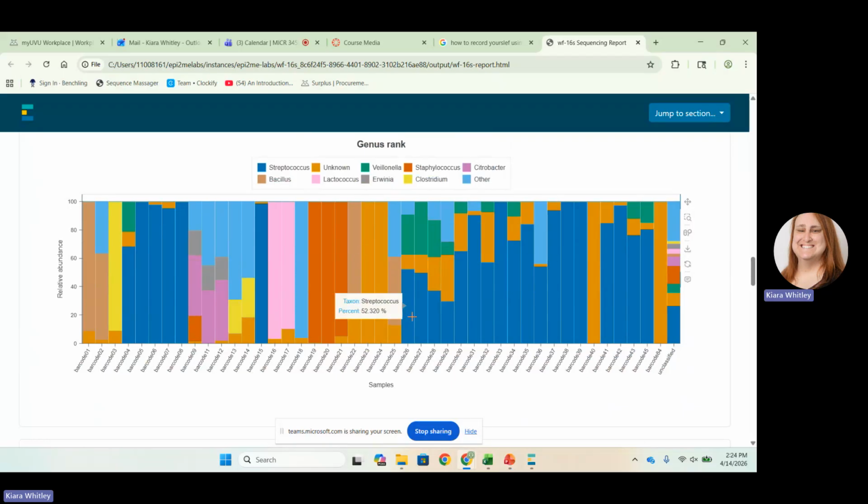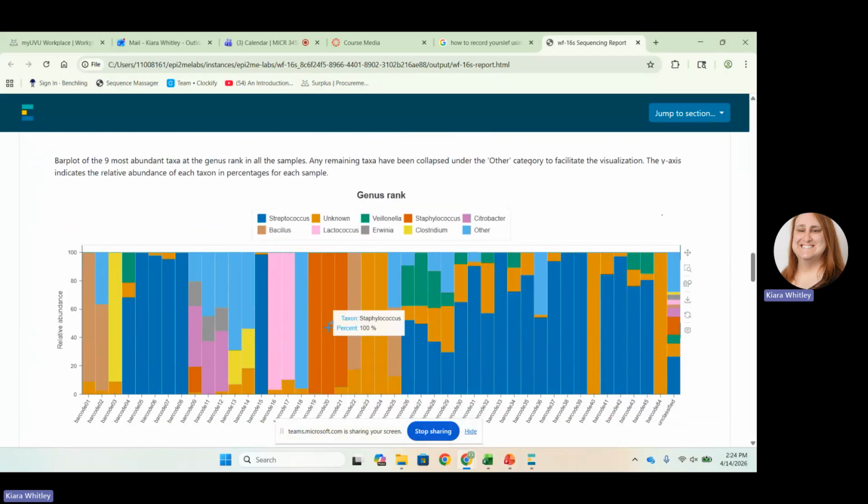If we go back to looking at number 18, it looks like we have a little bit of unknown here in the orange, and then just other different ones versus, say, our companion barcode 19. That's pretty different, where the majority of the next sample is Staphylococcus, whereas as we saw with the sunburst, there were other things that were taking part in this other category. So this is something that you can reference when you're asked that question for the final report.